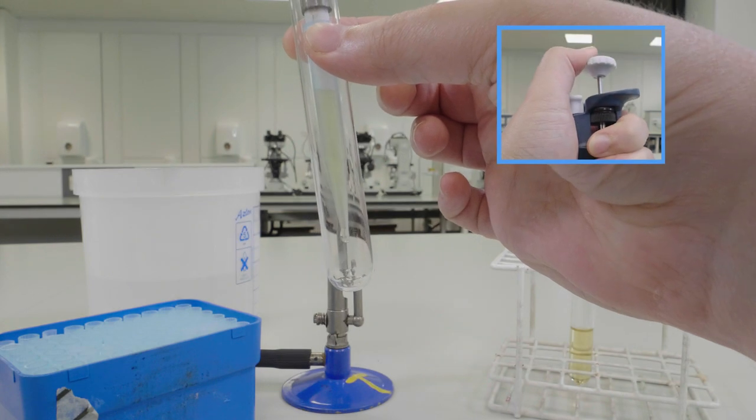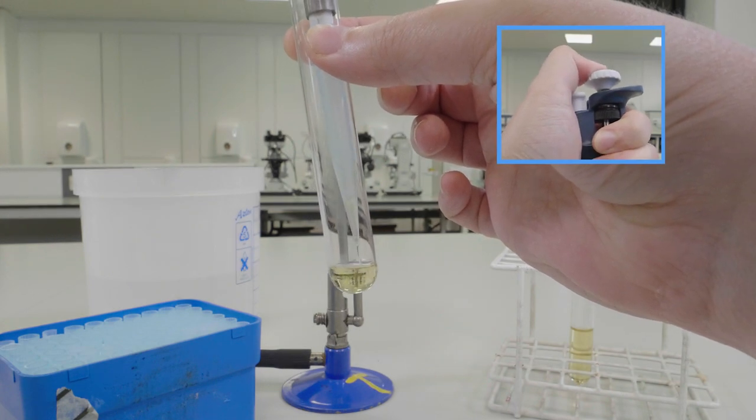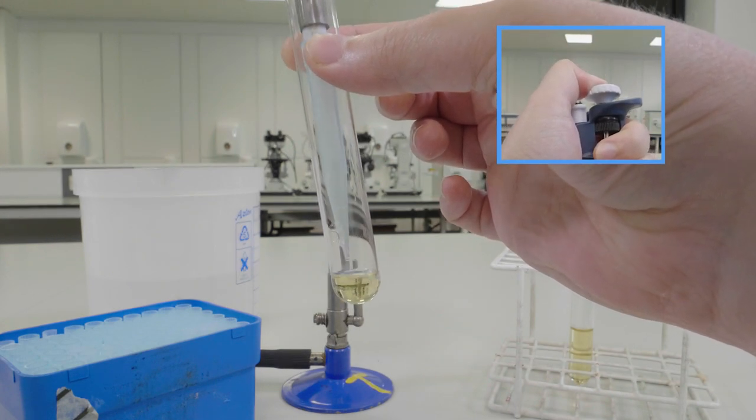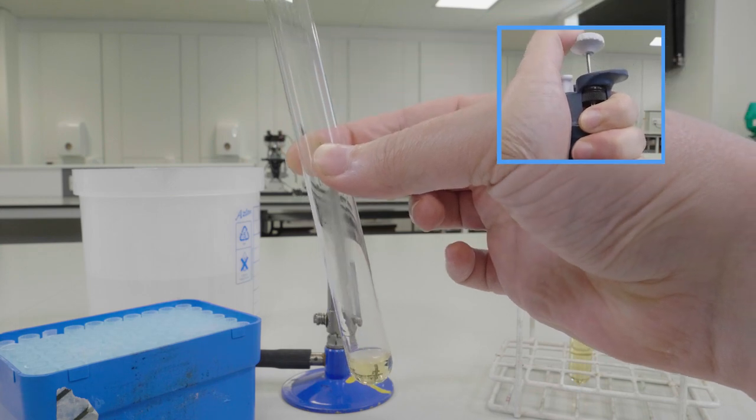To do this, push down to the first stop on the plunger and then the second stop to remove any remaining liquid in the pipette tip.